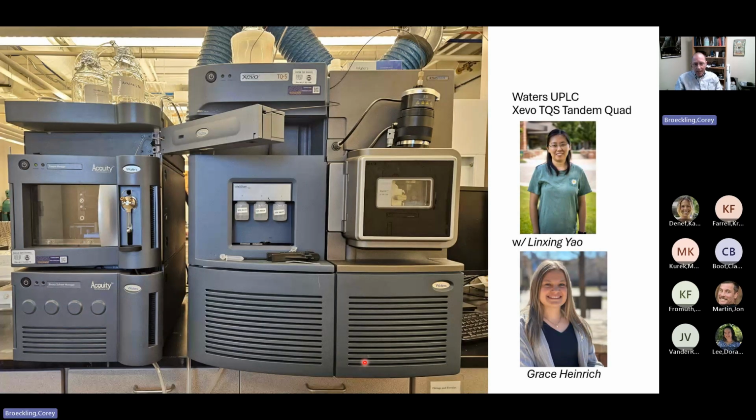And now I want to highlight some of the targeted applications, and really this is work done primarily by Lin-Sing Yao and working with Grace Heinrich. The instrument pictured here is a UPLC tandem quadrupole. So on the left is our UPLC system. This looks very similar to some of the other instruments I've showed you because it's the same manufacturer, same ionization source, same LC, same column. It's just that it's a tandem quadrupole, which makes it very well suited for targeted analyses.